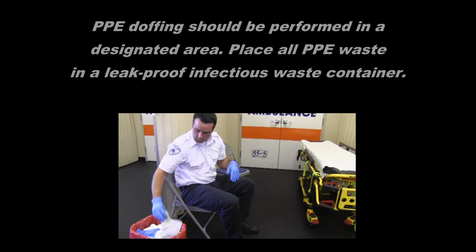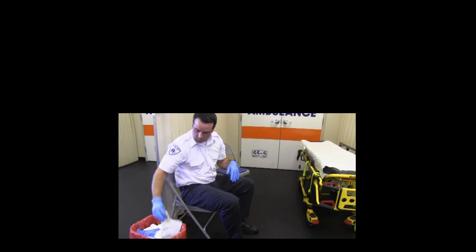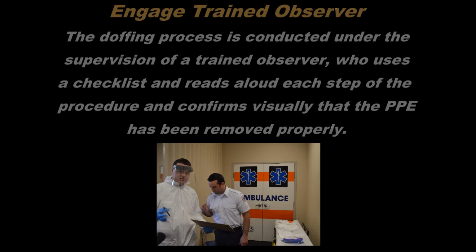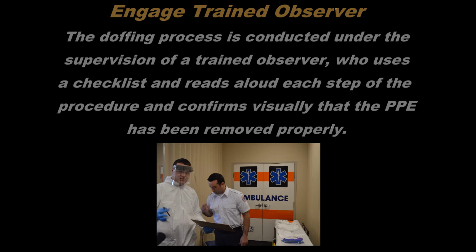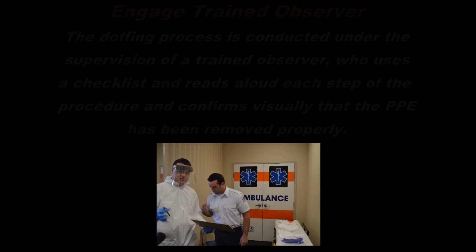PPE doffing should be performed in a designated area, and all PPE waste placed in a leak-proof infectious waste container. As mentioned before, you'll want to engage a trained observer. The doffing process is conducted under the supervision of a trained observer who reads aloud each step of the procedure and confirms visually that the PPE has been removed properly.